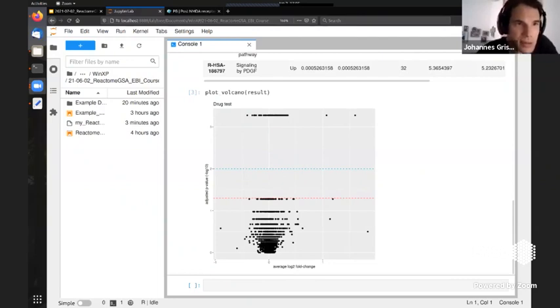Next one, to study network topology, can I use the Reactome FI network as a base extracted from the genes? So I'm not discussing Reactome FI here. Please send us an email. It's just a different tool that we have. How's the curation status for glycan information? Not great at the moment, so it's not complete, far from complete, unfortunately.